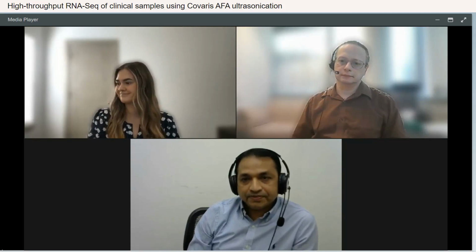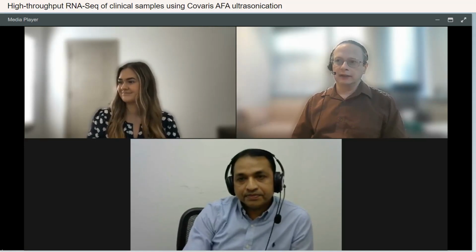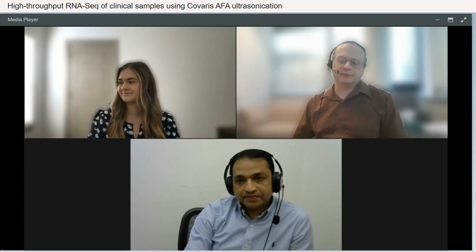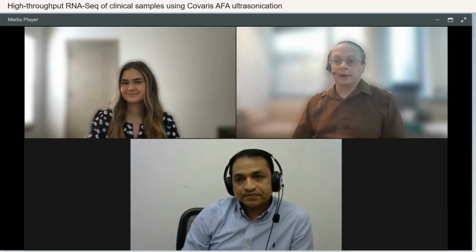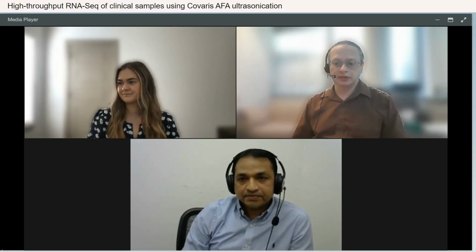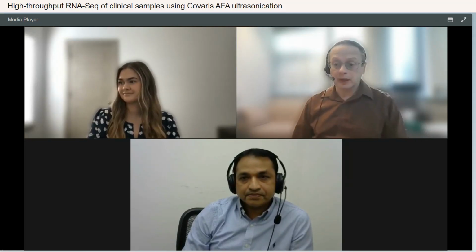Thank you. So for myself, I would say if you're doing one sample, you can get it to work, right? We've been doing that for ages. It's not super hard. But if you look at the protocols, they all begin by saying, optimize your fragmentation. Okay? And doing that optimization takes time.